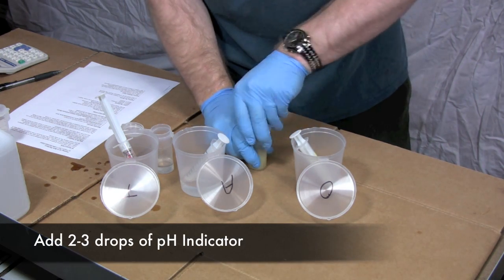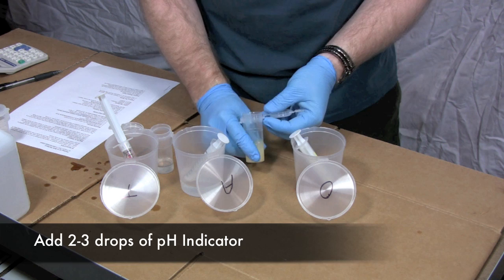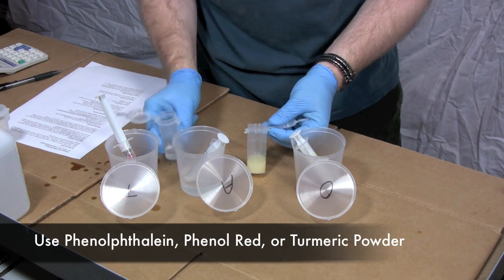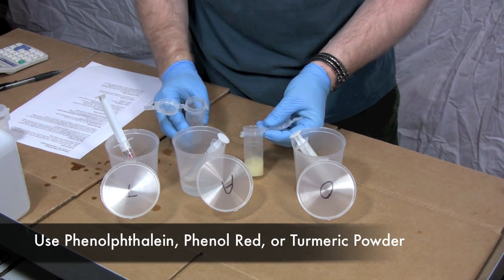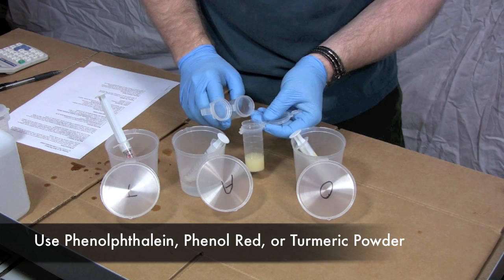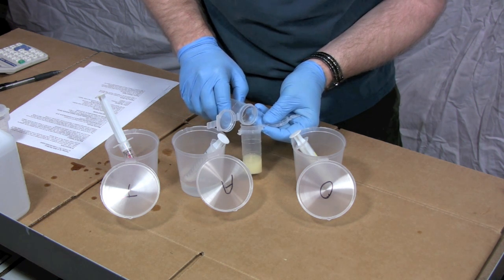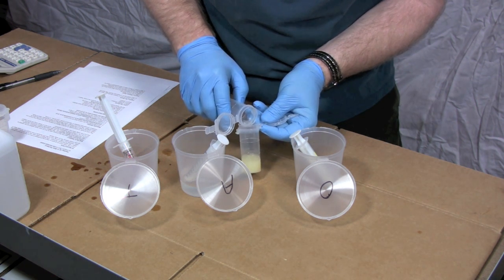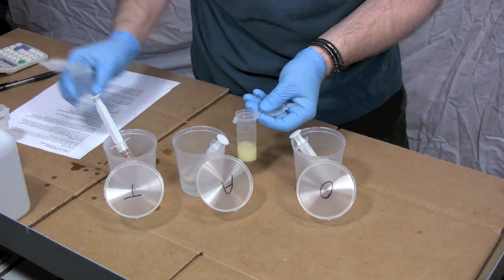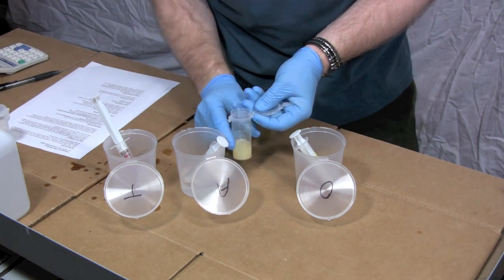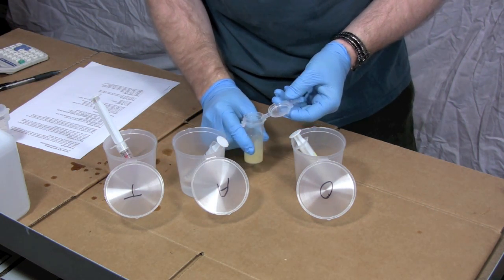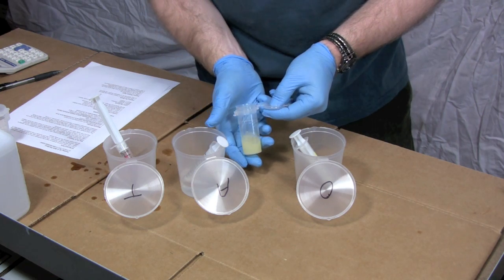The next step is I'm going to put a couple drops of phenolphthalein in there. Now again, you can use turmeric powder or phenol red, but I've got phenolphthalein here today. It doesn't really need to be much at all. What this is doing is it's just going to change color when we hit a certain pH. Our sample is now ready to titrate.